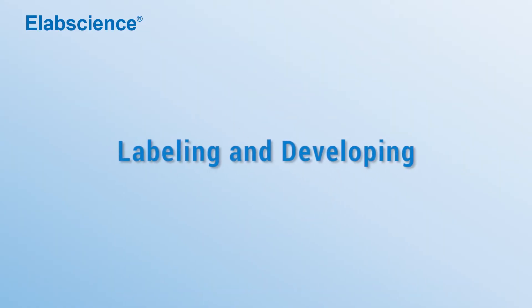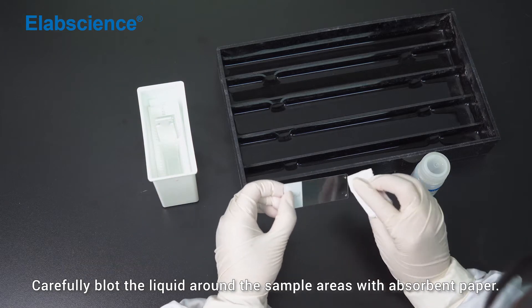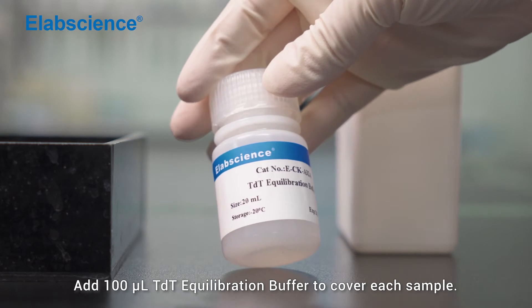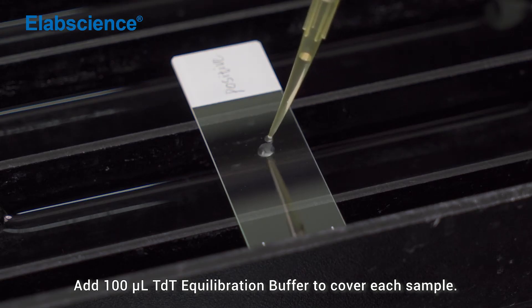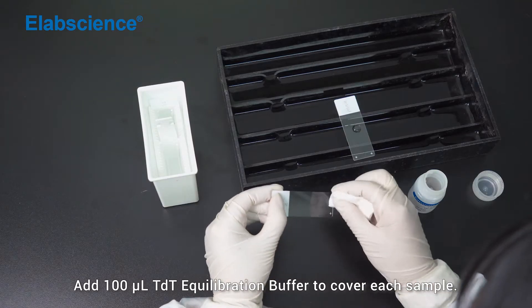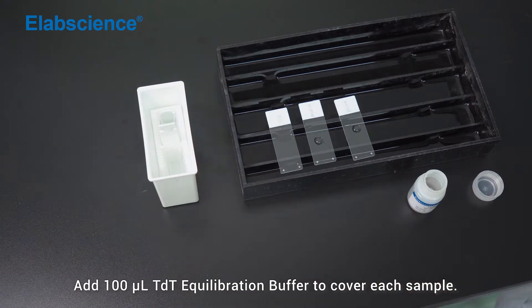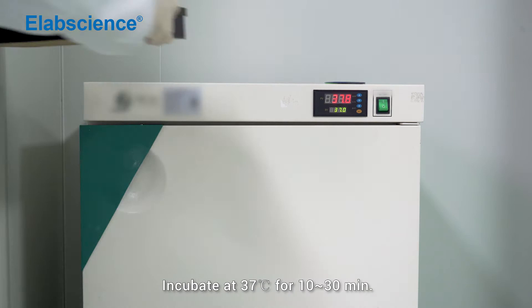Labelling and developing. Carefully blot the liquid around the sample areas with absorbent paper. Add 100 microlitres of TDT equilibration buffer to cover each sample. Incubate at 37 degrees for 10 to 30 minutes.